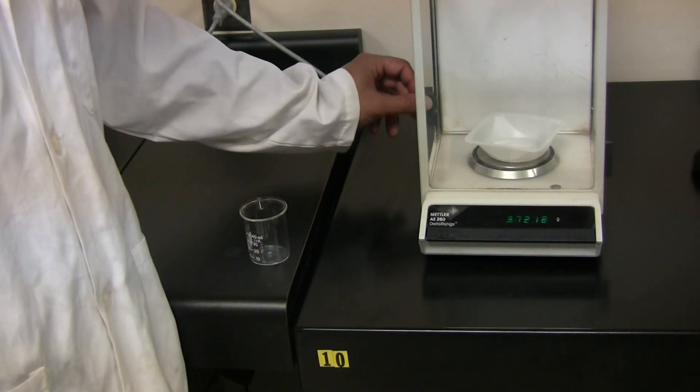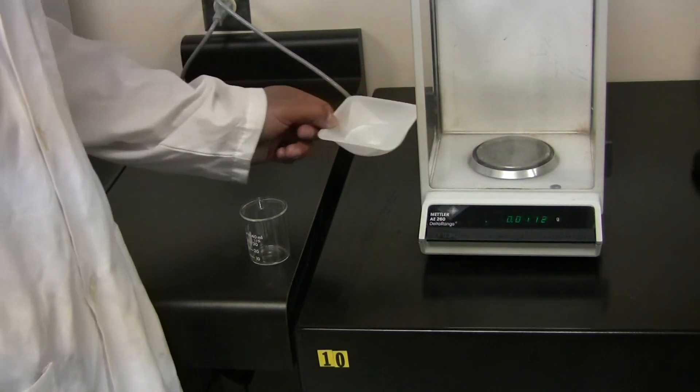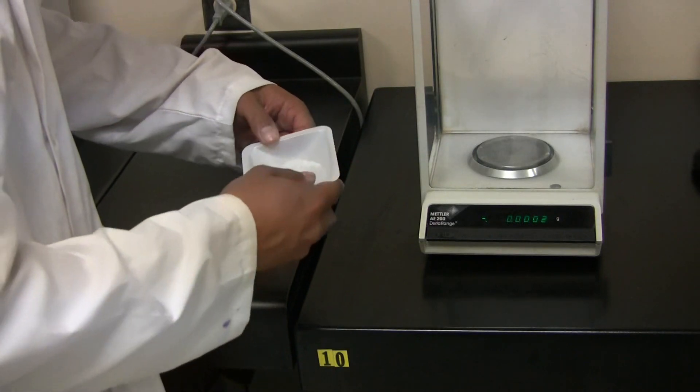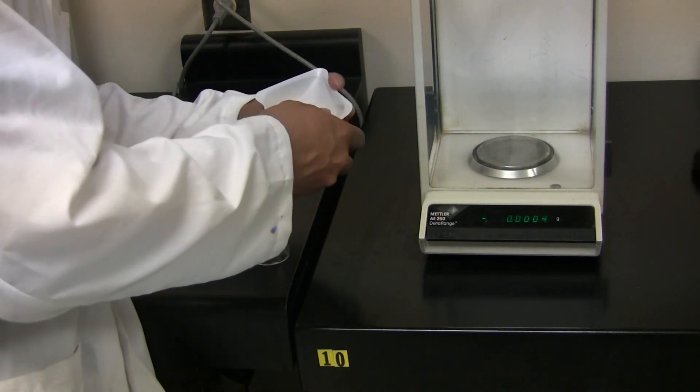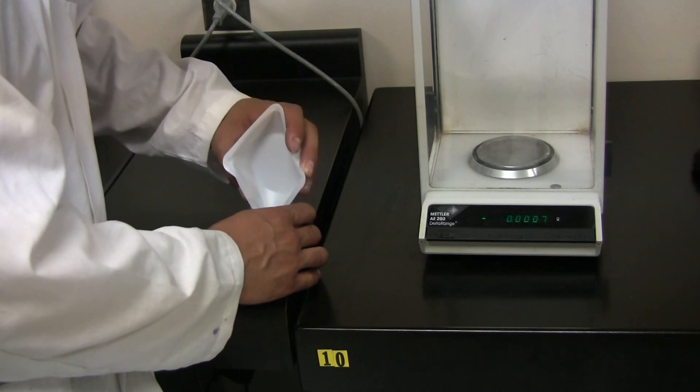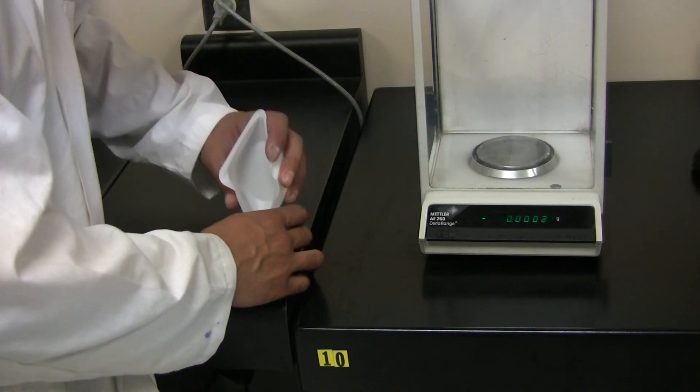Once finished, you need to remove the weigh boat from the analytical balance and pour this directly into your reaction flask. Make sure to get out as much as possible.